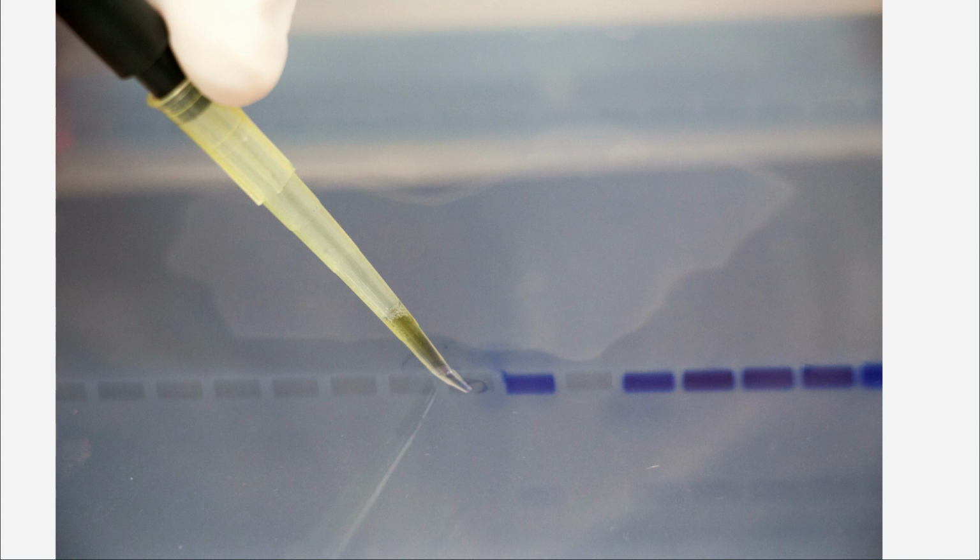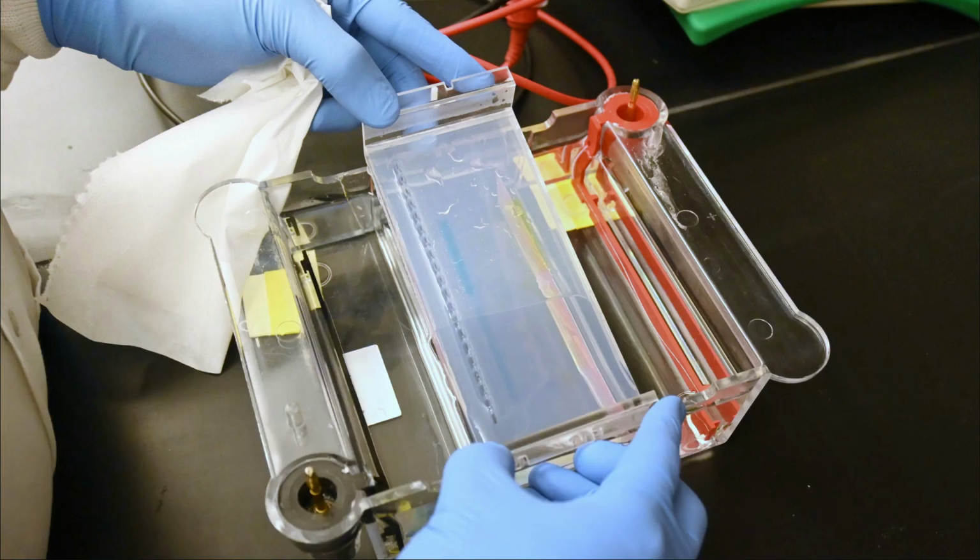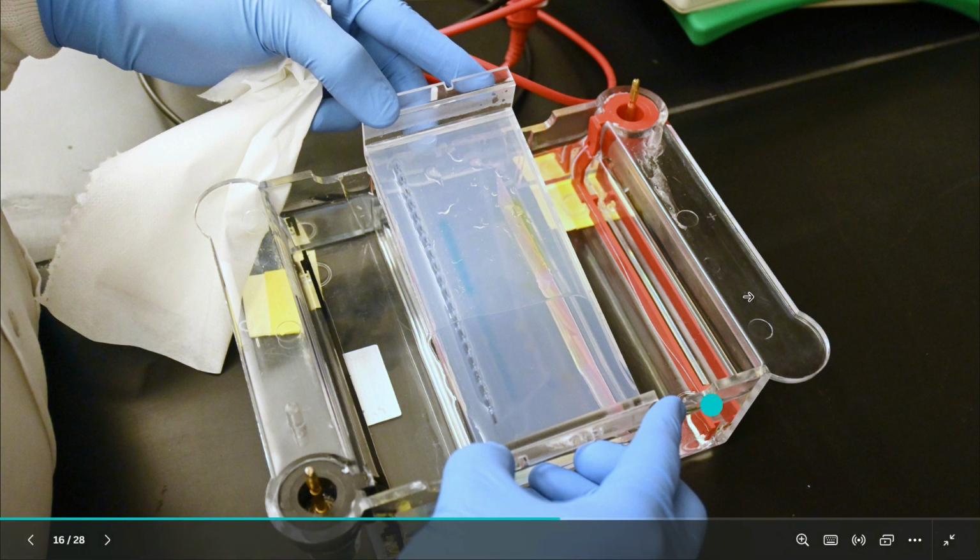The electrophoretic technique is usually used to separate biomolecules, especially DNA, RNA, and proteins. DNA and RNA have a net negative charge, whereas the protein might be positive or negative depending upon the type of amino acids. What we usually do, this is the chamber here.